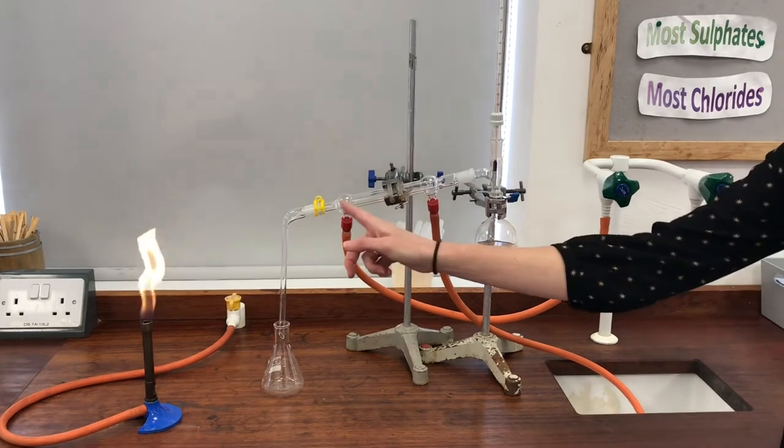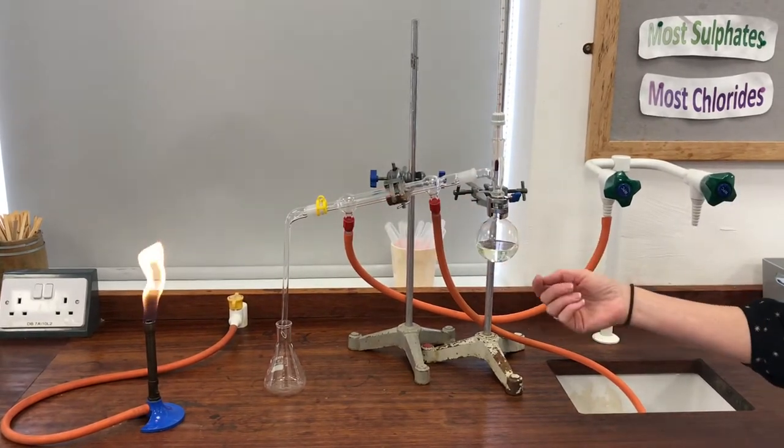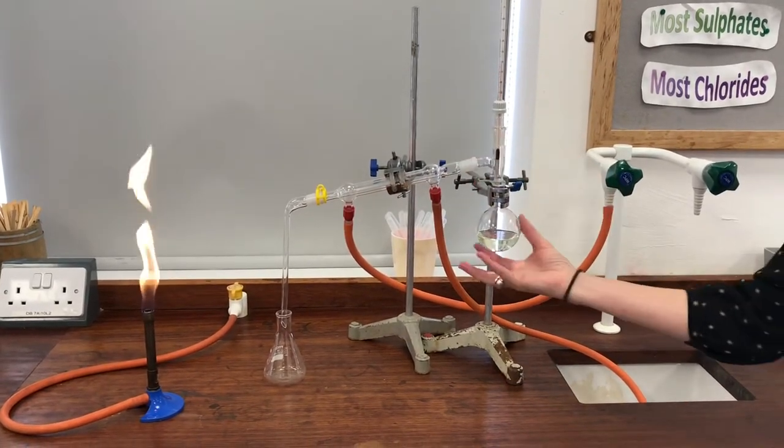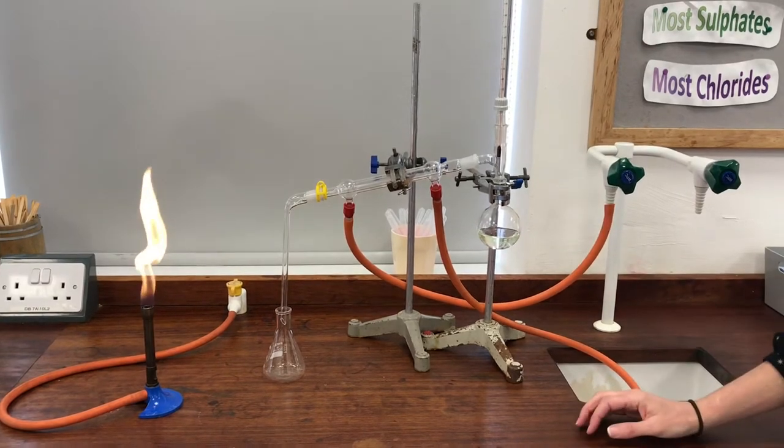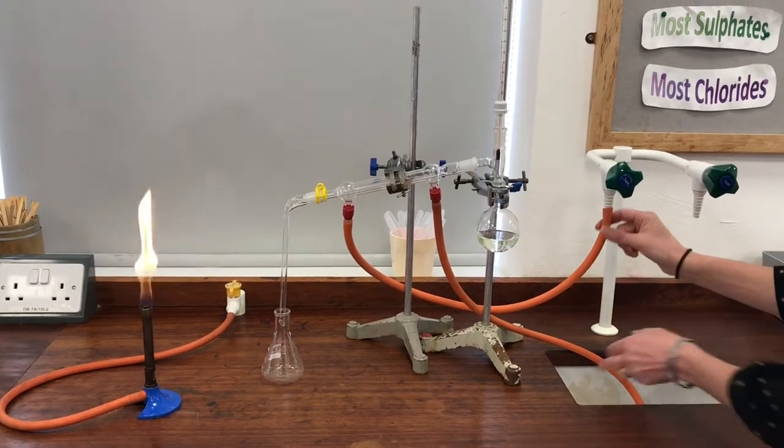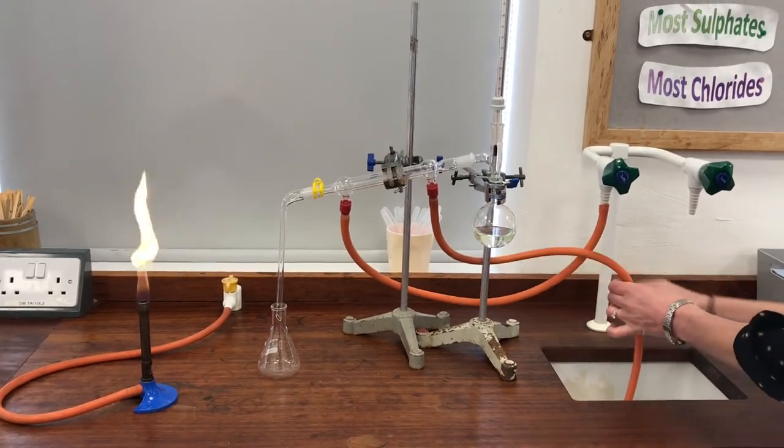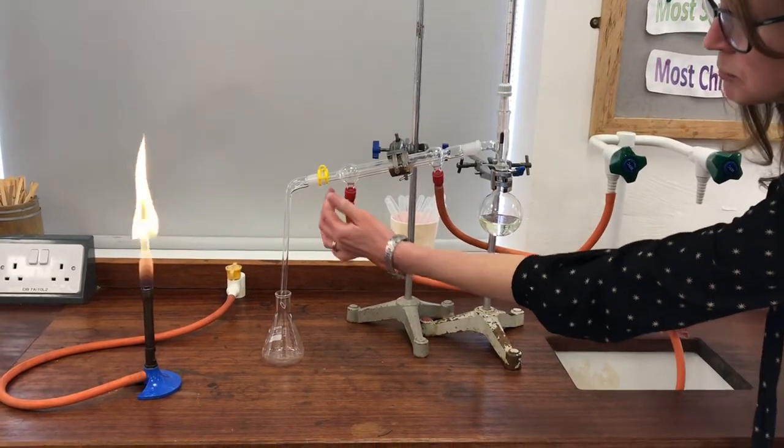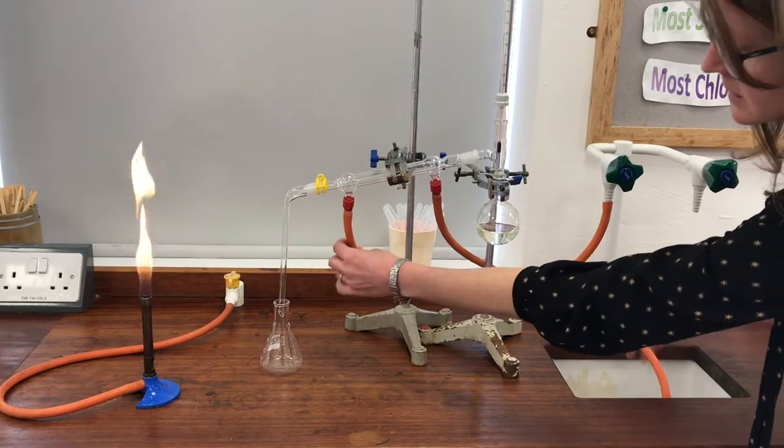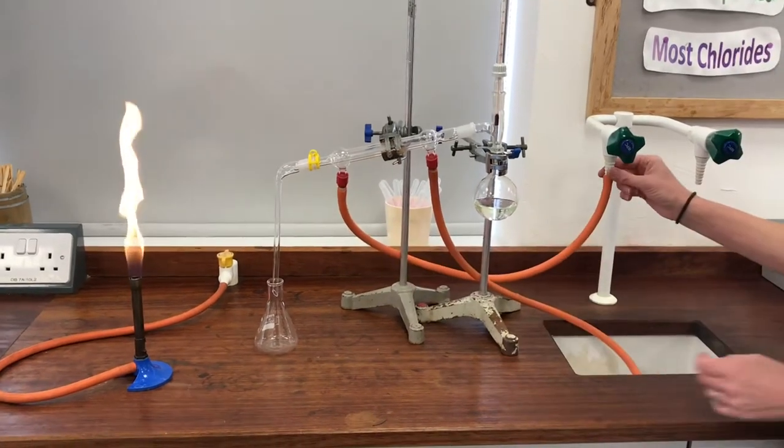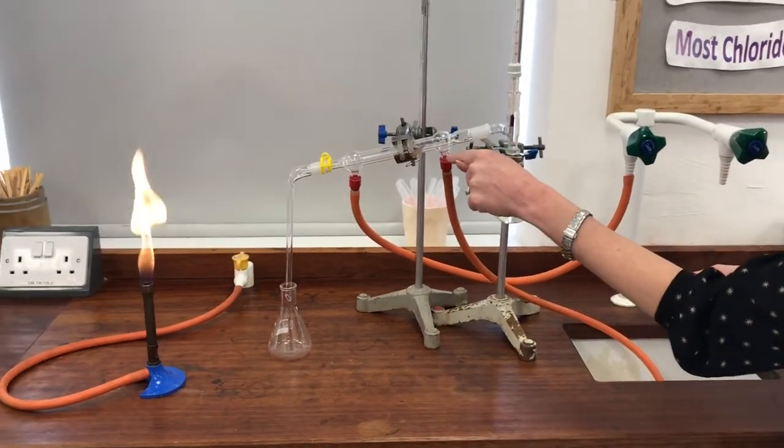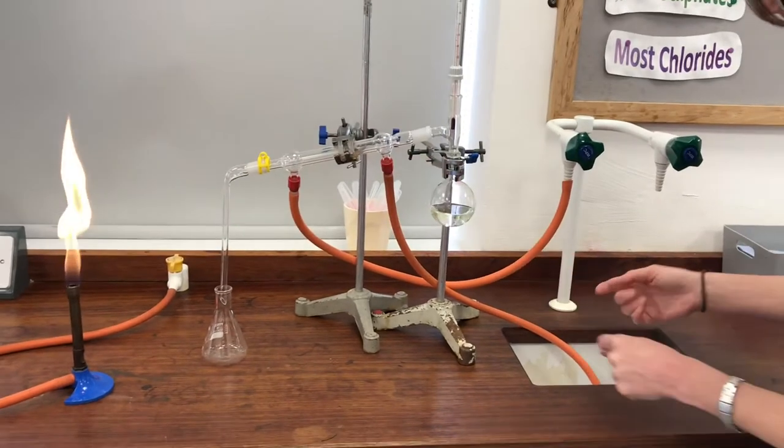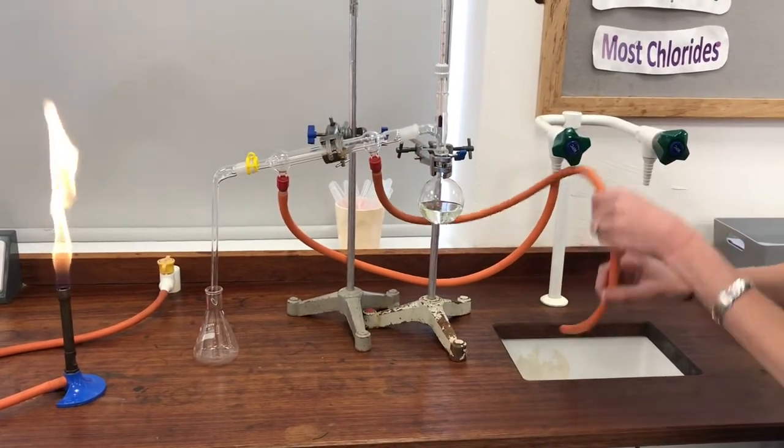Now you can see I've got the condenser here set up in the correct orientation so it's attached to all this system of glassware and I've got these hoses attached to it as well, and I have to be really careful about which way round I attach them. The water always goes in at the bottom of the condenser here, so you can see this hose is attached to the tap, and the water comes out at the top of the condenser here, and this hose is empty and that's just going to point down the plug hole.